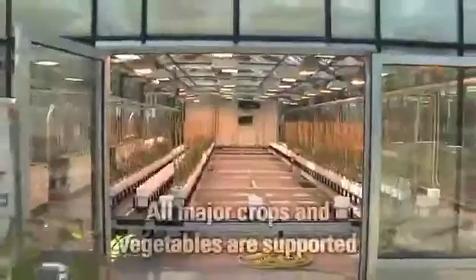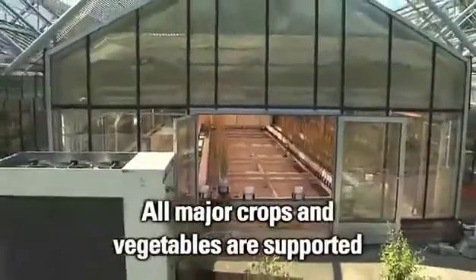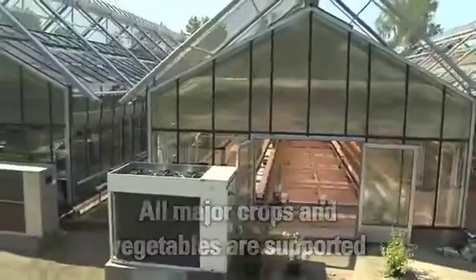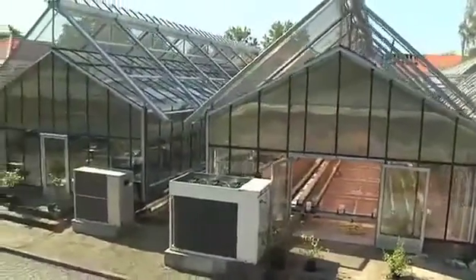The Lemnatec Scanalyzer systems can be used for all major crops and vegetables to provide reliable high-content phenotyping data.